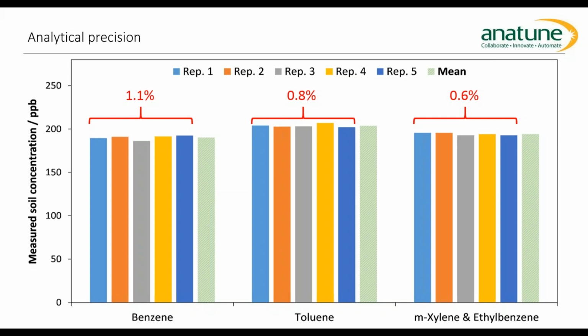Again, I will hasten to add here, there is no internal standard in this method. So this is all analyzed as it comes out of the headspace. There's no normalization with an internal standard. So again, analytically, the system is inherently precise.